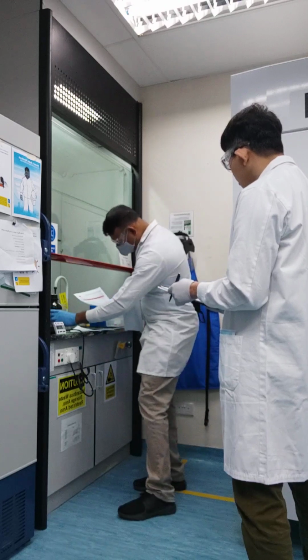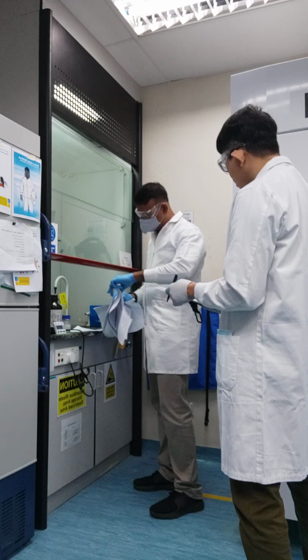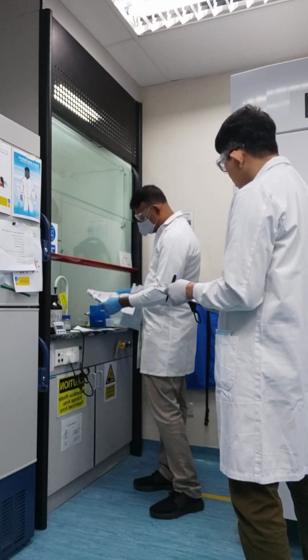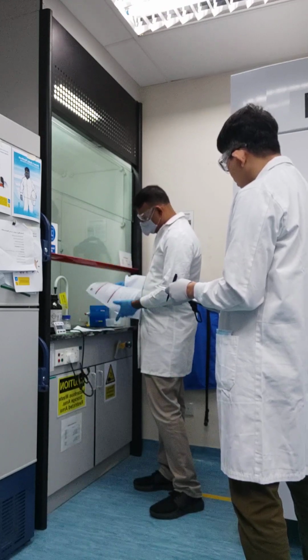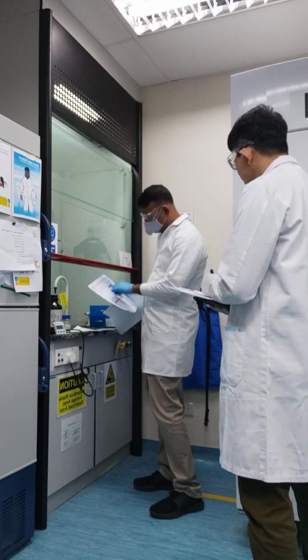For this chemical reagent, we have the safety data sheet, and section 2 gives you the information about the hazards and the personal protective equipment that needs to be worn.